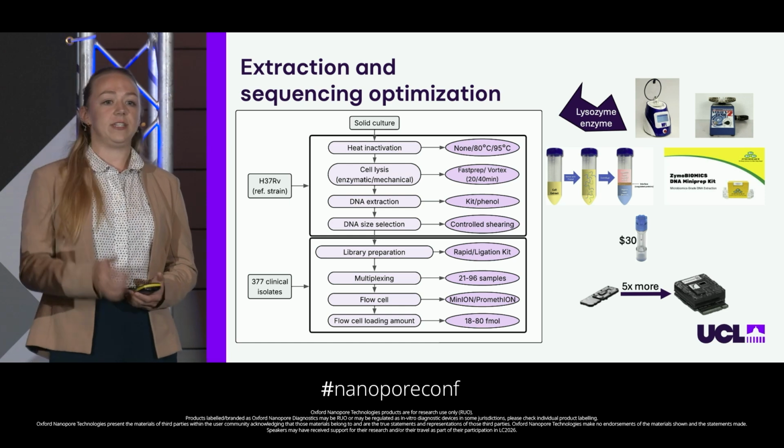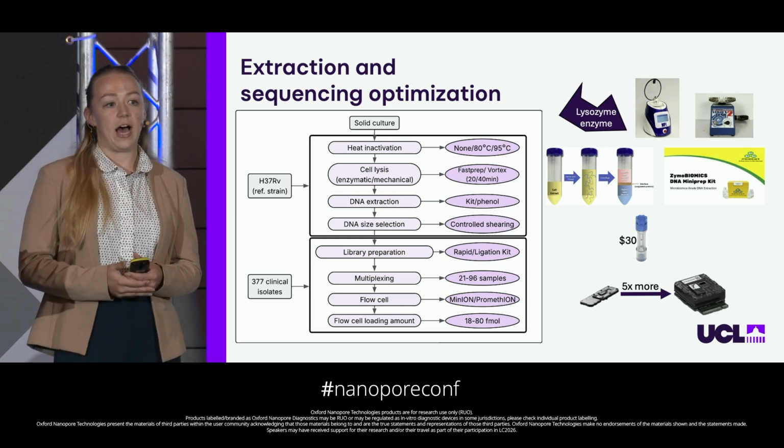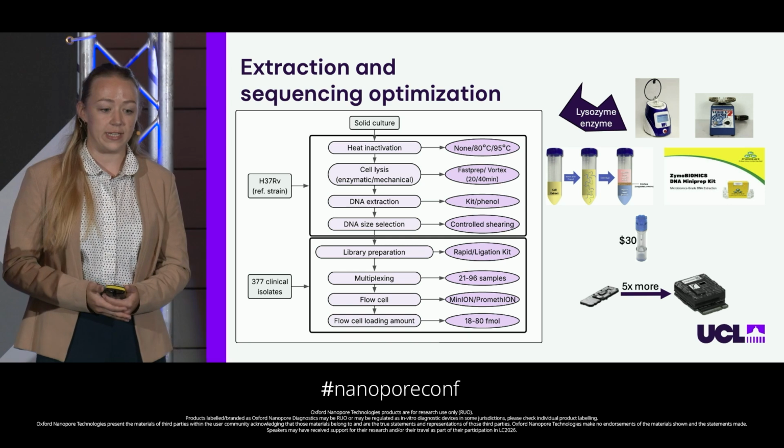So what we did is we broke down every step of the extraction and sequencing pipeline and made variations and saw how we could optimize every step. I'll just talk about some of the key optimizations that we did.